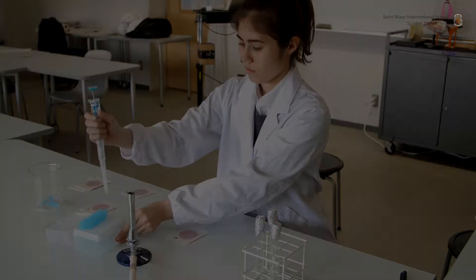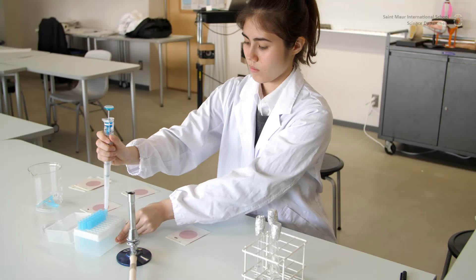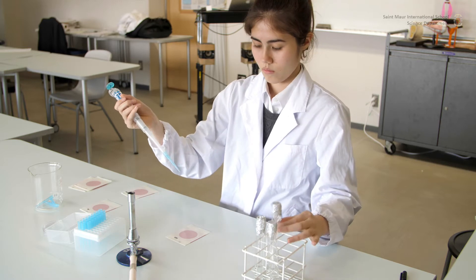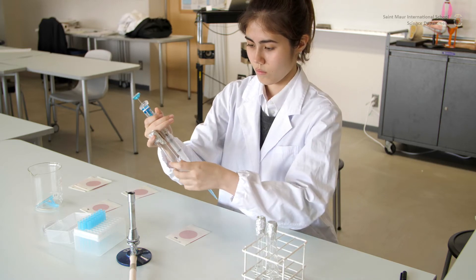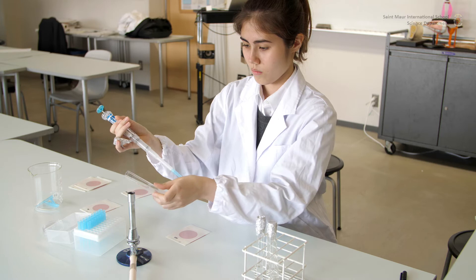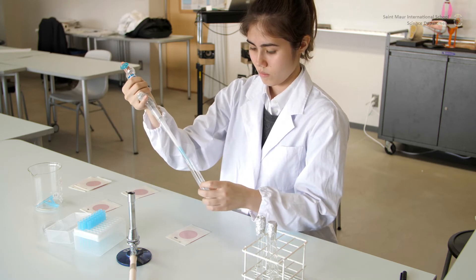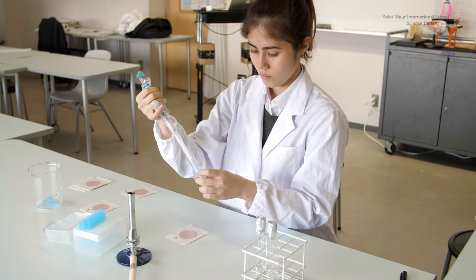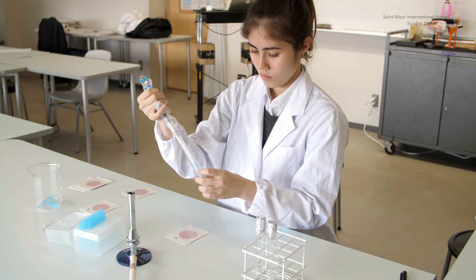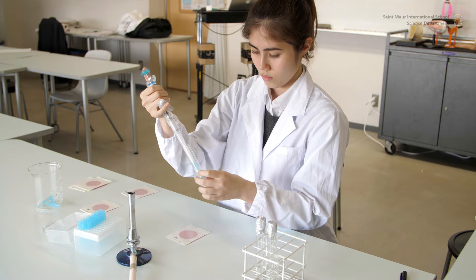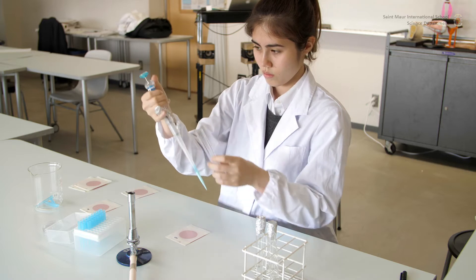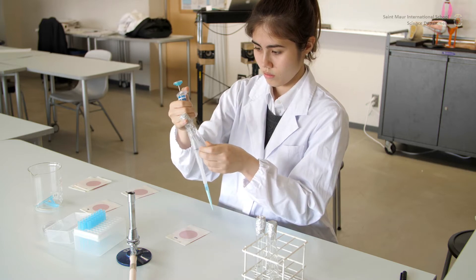Microbial Load Estimation in Liquid Samples: The 3M petrofilm plate system is used in many microbiology-related industries and fields to culture various microorganisms. They are designed to be a faster, more efficient method for detection and enumeration compared to conventional plating techniques.